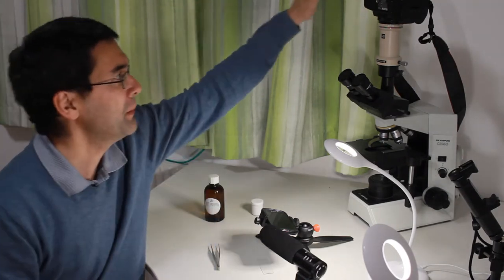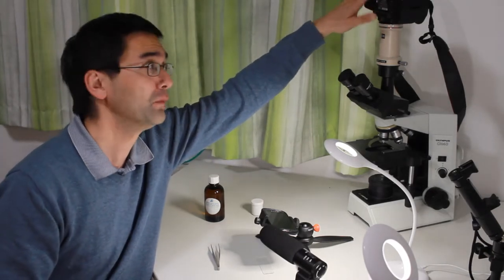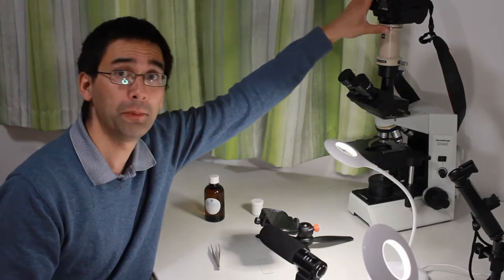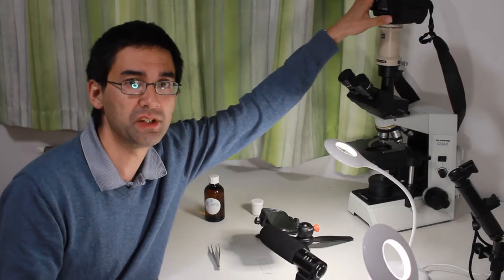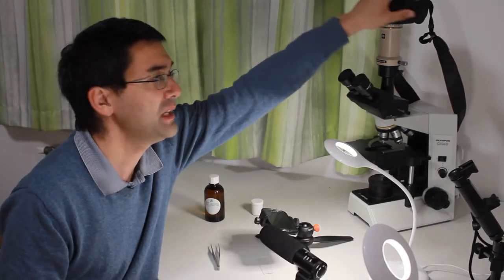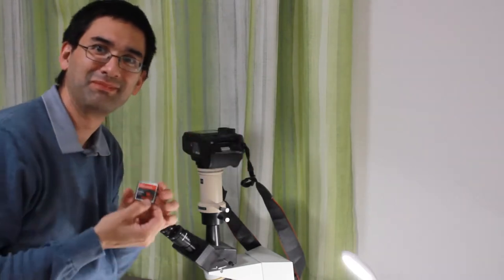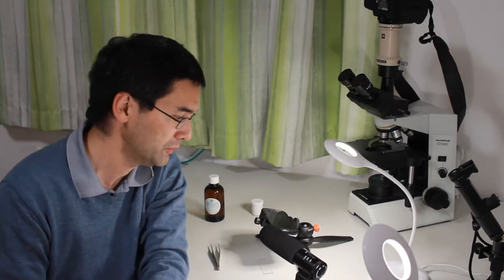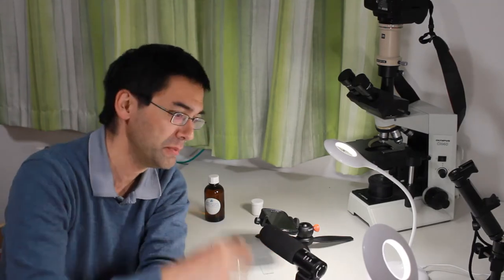For taking pictures under the microscope, I'm of course using my Olympus CH40. I have another DSLR camera, a full format camera, mounted here on top. This gives me a very good image quality as well. Then I take out the compact flash card, and I go to the computer, download the file again, and start editing. So that is essentially all I'm doing, and right now I'm just going to move the camera down a little bit, and I'm going to show you what I'm actually going to be doing here.